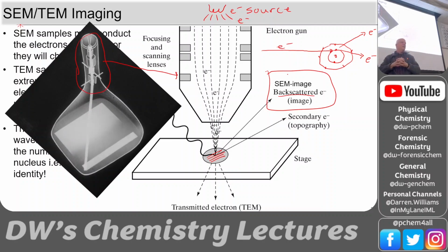Have you ever seen an Olympic swimming pool with the stripes, a competitive swimming pool with the stripes and the lane markers before anybody gets in? You can see perfectly, you can see the straight lines, you can see the tile on the bottom, you can see all of that. That's when your sample's not charged. Somebody starts jumping in and changing the waves, what happens to those stripes? They start to get all wiggly. You can't see the fine images of the tile or anything anymore because you've got such a distorted image. That's what sample charging looks like.